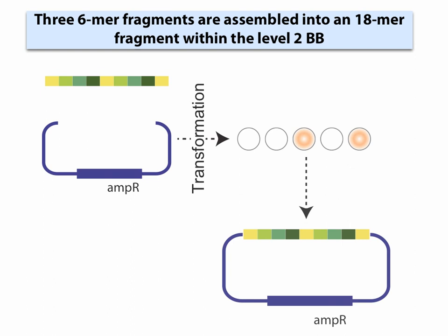We usually generate clonal bacterial cultures by growing the transformed bacteria under limiting dilution conditions as shown on the right. This method can easily be automated on a liquid handling workstation and yields clonal plasmid DNA as early as the following day.